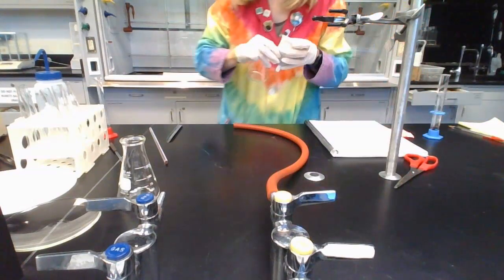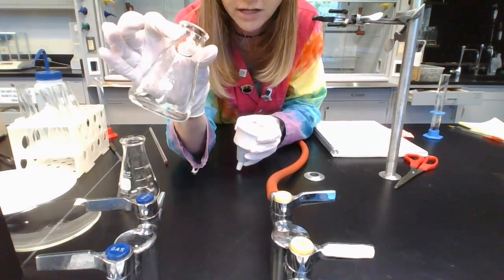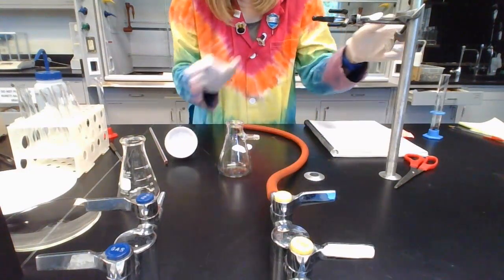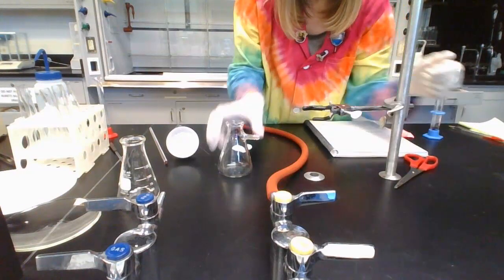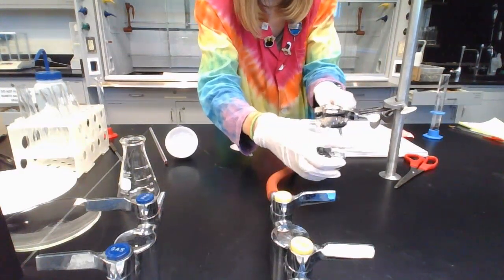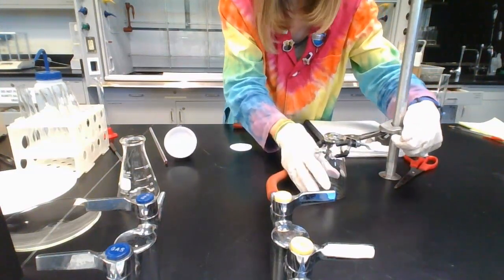milliliter filter flask. Filter flasks look like Erlenmeyer flasks with an arm. Okay, so that's the difference. That's the filter flask, okay? And it says 125 on it. Then you are going to use the clamp. I would just say use the same clamp that you used earlier to clamp that filter flask, like attach it in place. And we want to lower it so it's sitting on the lab bench. But what happens is we don't want it to fall over. So we're clamping it in place so it's nice and sturdy.